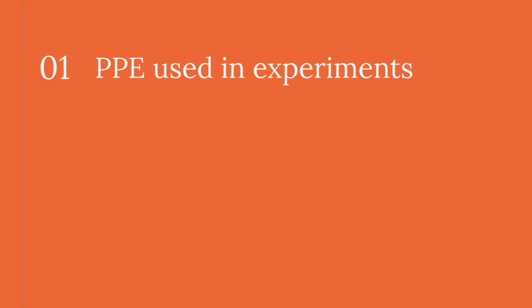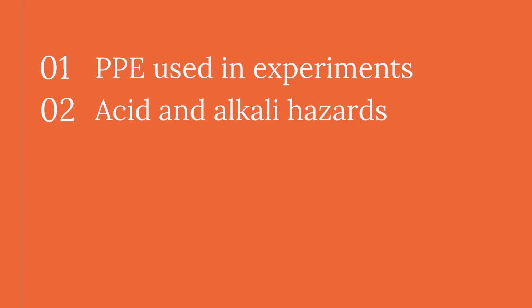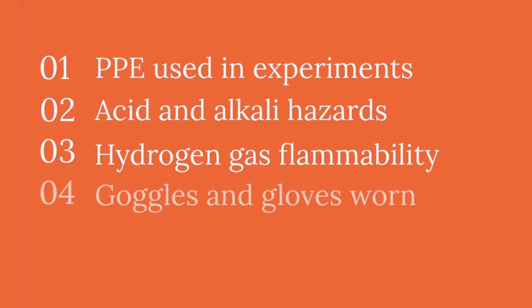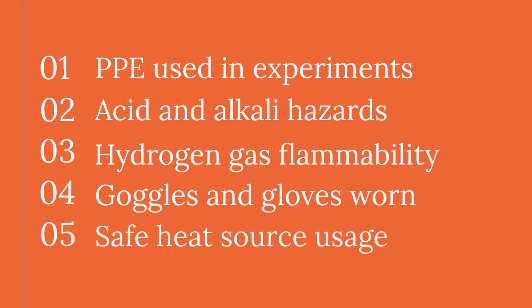Safety was paramount, with appropriate PPE used in all experiments. Main hazards included acid and alkali irritation and hydrogen gas flammability. Controls involved wearing goggles and gloves and careful handling of materials. Heat sources were used safely to prevent burns. Awareness of glassware breakage risk was maintained throughout.